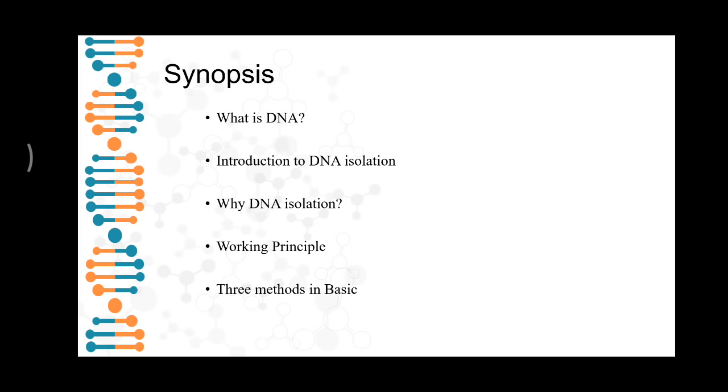Well, the DNA is said to be the blueprint of all the structural and functional characteristics of living organisms, which are stored in it. Then we'll introduce you to DNA isolation: why the DNA is isolated, that is the importance of DNA isolation, the working principle and mechanism involved in it, followed by the three basic methods which are predominantly used.